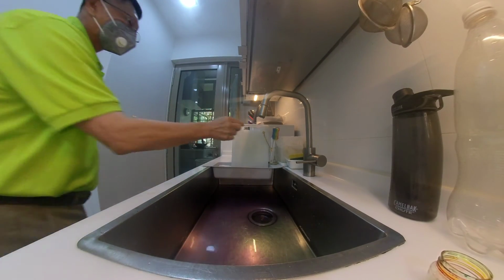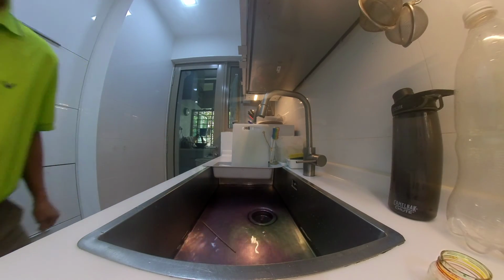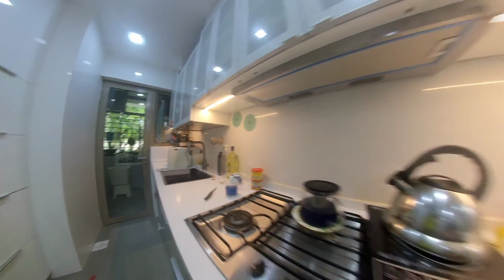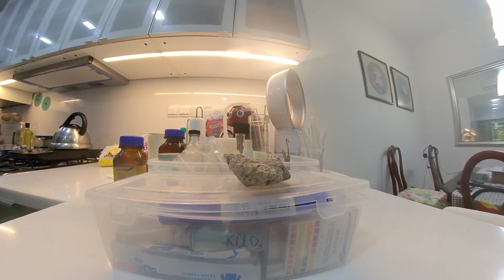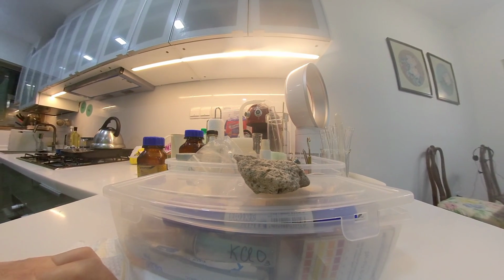Never mind. Now I got to clean up the potassium. Okay. Yes. That's good, that's good. Yeah, that will be a good experiment to put on YouTube.